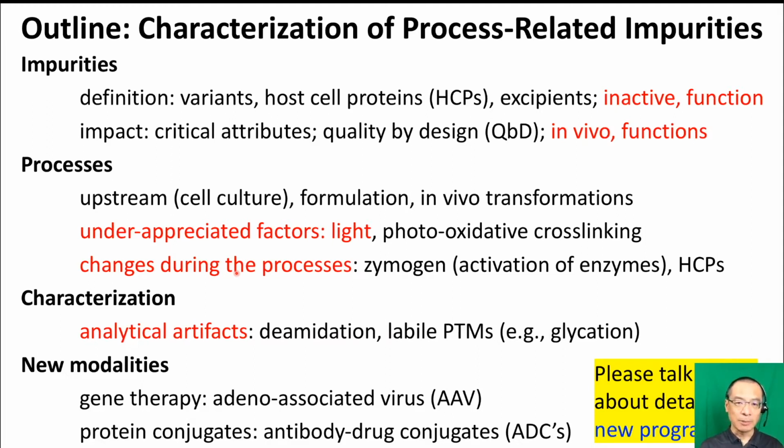And in terms of impact, there is a long-going program in this field about critical quality attributes and also programs about quality by design. Again, this ties impurities into different tiers, what is important, that is related to in vivo functions as well. So there are several things I will share with you today.